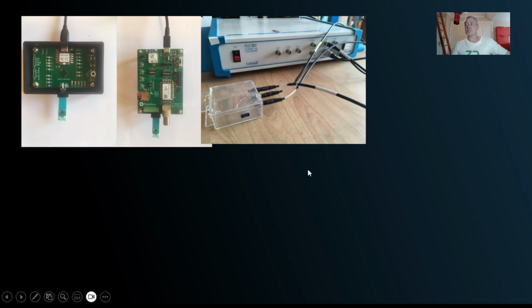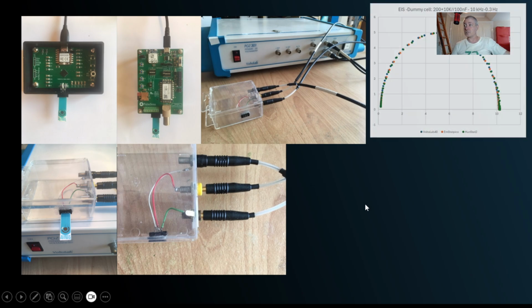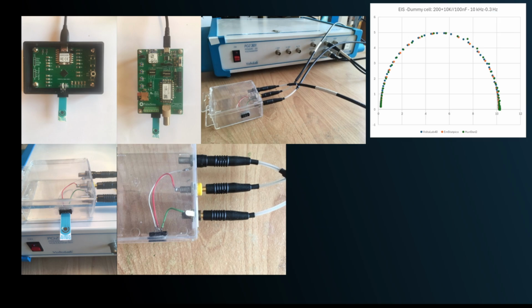That said, they've got these 3 potentiostats, and they've been testing the screen printed electrode on them, and they've been getting different results. So on the dummy cell, they do get this kind of nice, consistent Nyquist plot. Yeah, I was just thinking for a second, where's the diffusion characteristics? But of course, it's because they don't have any diffusion.